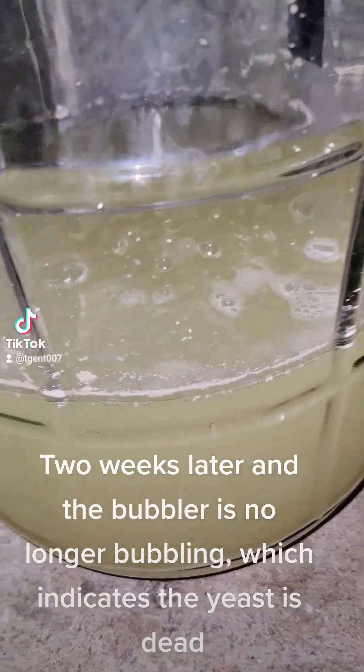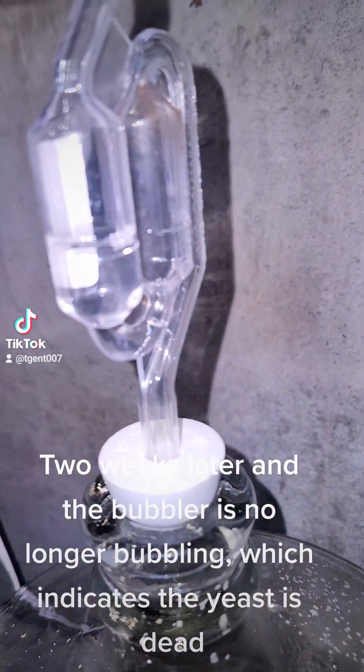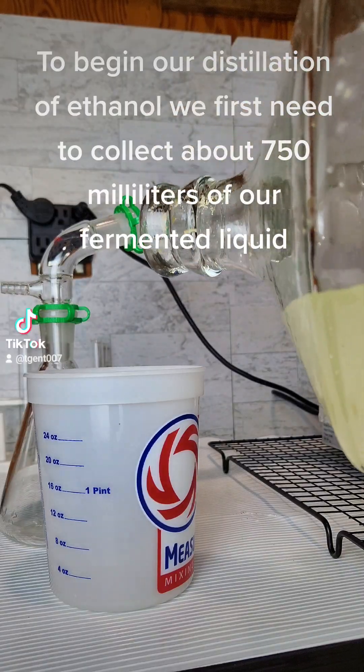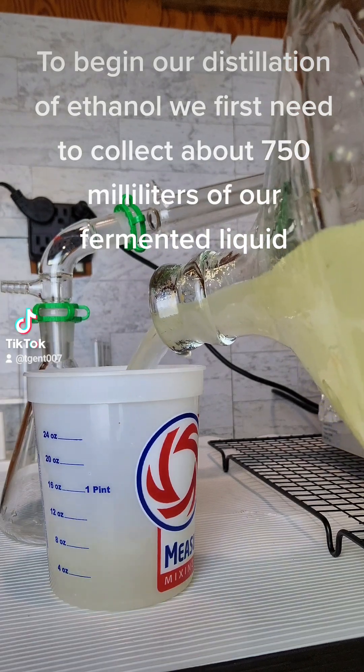Two weeks later and the bubbler is no longer bubbling, which indicates the yeast is dead. To begin our distillation of ethanol we first need to collect about 750 ml of our fermented liquid.